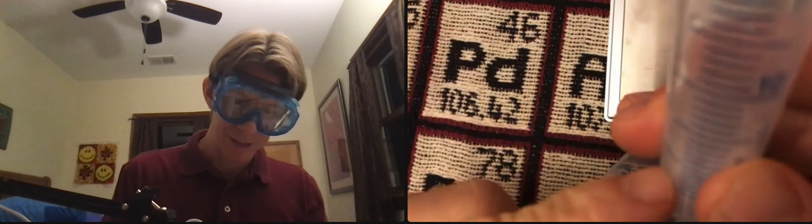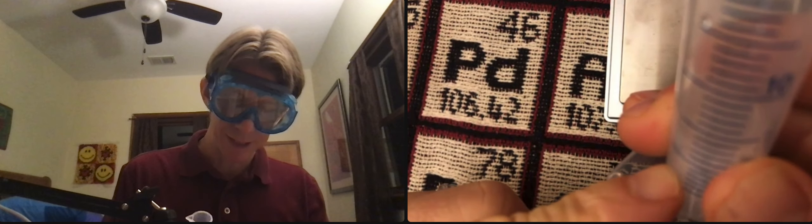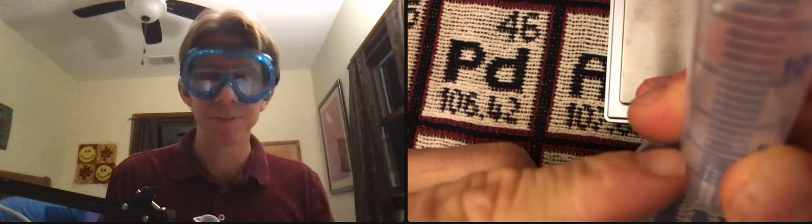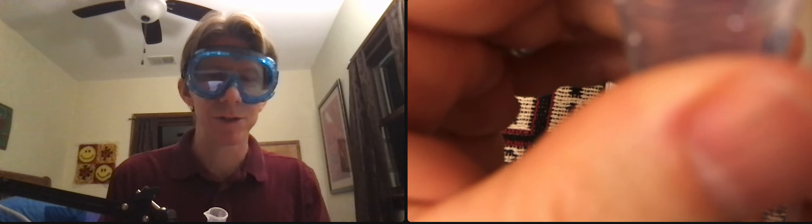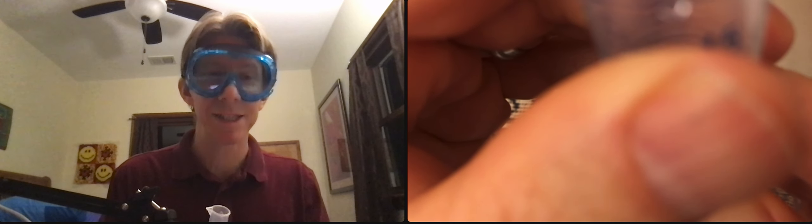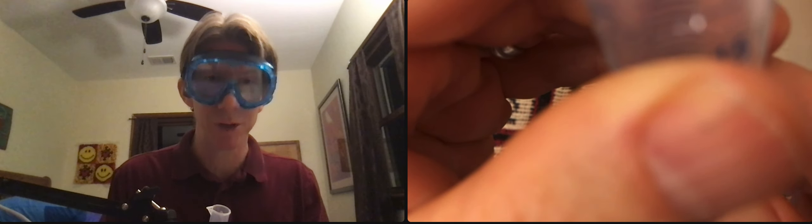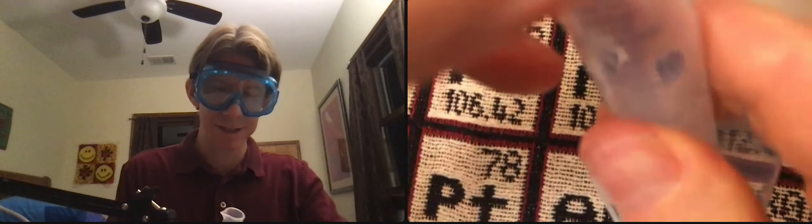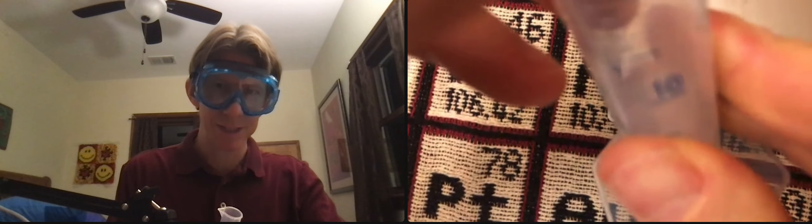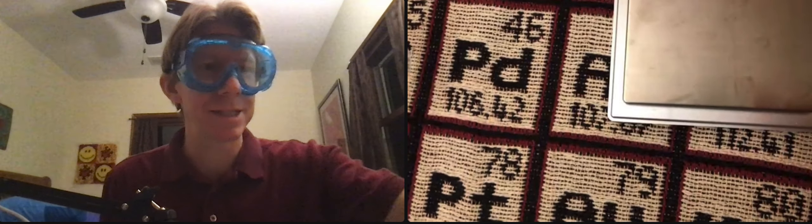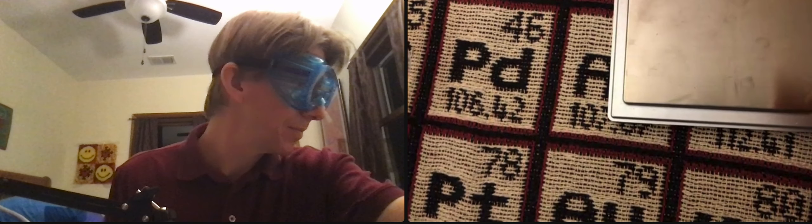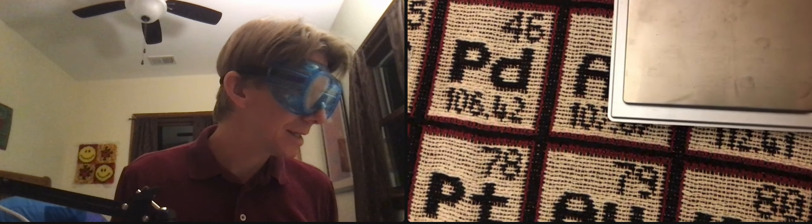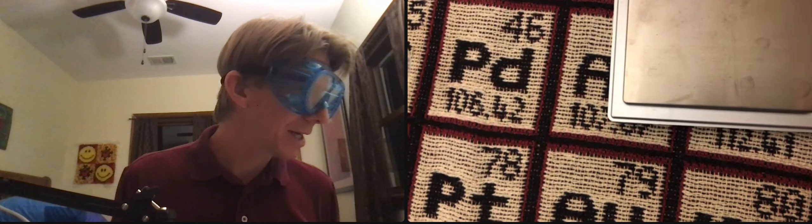Definitely feel the graduated cylinder. You can start to feel it getting warm. This is an exothermic reaction. It gives off energy. And it's not too warm yet. It's getting there, though. And I'm going to set this aside. And we'll come back when it's done.